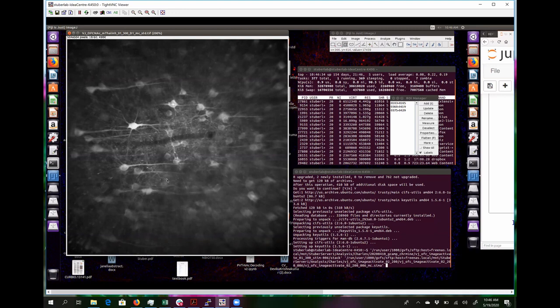Yeah, because depending on how you draw your ROIs, you could be getting false positives, where you have a dendrite that is active in a certain condition overlapping with a cell that is not, and then you would basically detect two times as many. Exactly. I mean, that's just one possibility. That's one of the obvious ones, right?